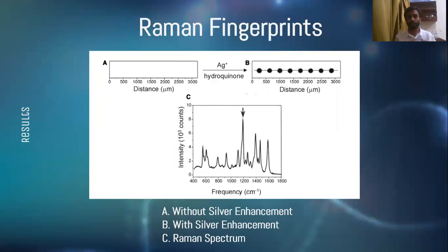is consistent with all the experiments that you will perform in order to detect a particular DNA target. So if you are, let's say, targeting a DNA sequence A, then whatever Raman tags you use, these Raman tags can still help you identify the particular sequence A, and you can easily cross match the whole target using this characteristic Raman fingerprint. So this is the role that the Raman fingerprint plays for a particular oligonucleotide sequence.